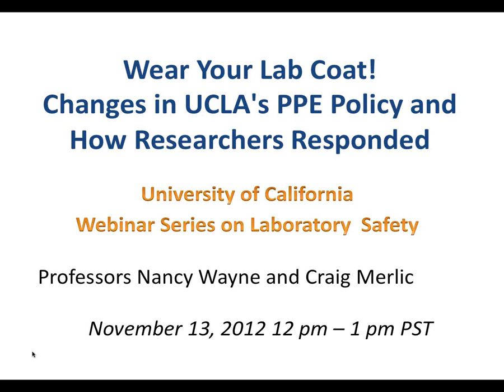Oftentimes, at least in the type of research that goes on in my laboratory, you have to babysit. You have to be on top of your experiment for 12 hours straight. You've barely got time to go to the bathroom. So it makes it very challenging. You really can't set up a table out in the hallway because that breaks fire marshal law. So it's a really difficult issue, but no food and drink in the lab, no such thing as a clean area unless there is a door separating you, who's doing the eating and drinking, from the laboratory.